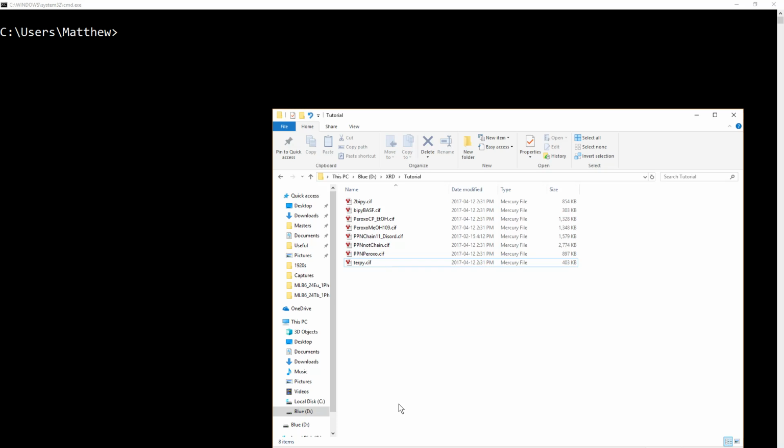The first thing is the Cambridge Crystallographic Data Center does not recommend you combine your CIF files before uploading them. Apparently, there are occasionally issues splitting them back out into multiple files for inclusion in the database. However, journals do prefer you submit them as one file, so I'm going to show you this method.